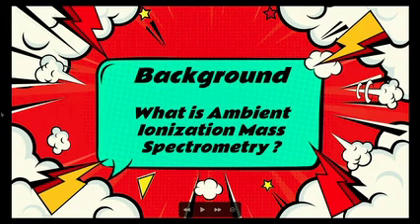So the first thing is, what is ambient ionization? For those of us that do ambient ionization, we know really quite a lot about it, but people that are used to doing LCMS or GCMS based metabolomics, lipidomic studies, or targeted analysis might not really know much about ambient at all. So we'll just start by introducing what it is.